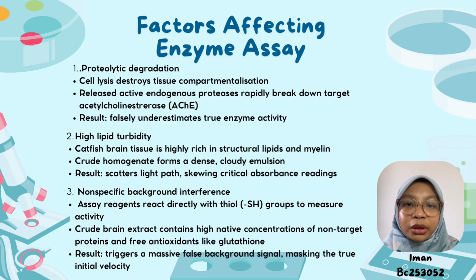The colorimetric reagents used in this assay react directly with thiol groups. Since crude brain tissue contains a high concentration of non-target proteins and free antioxidants like glutathione, it triggers a massive background reaction that masks the true initial velocity of our enzyme.